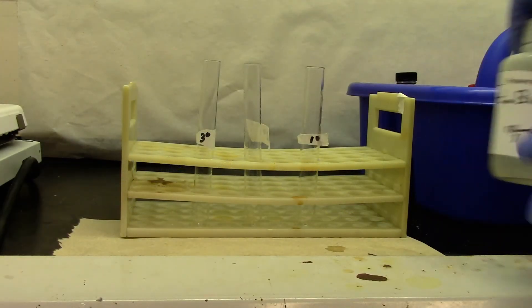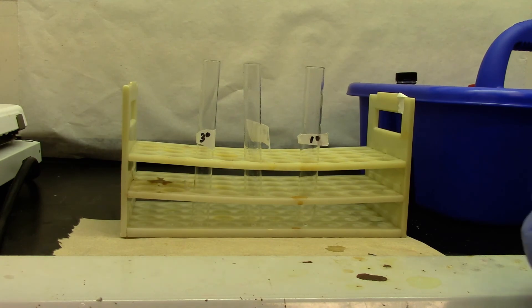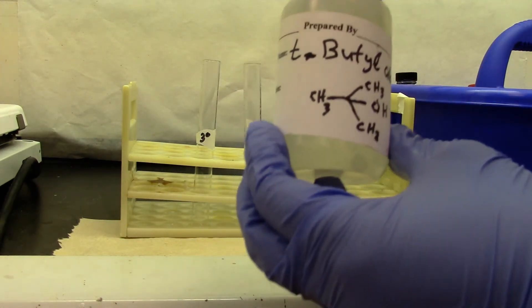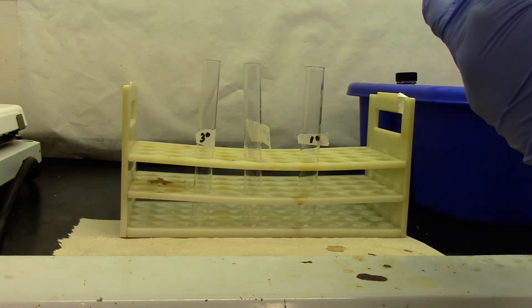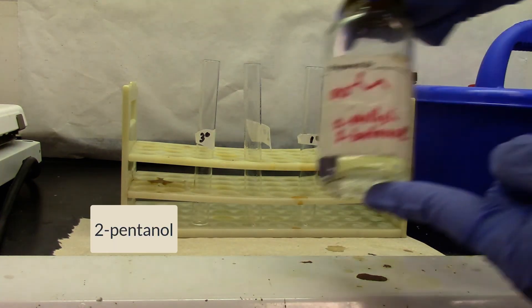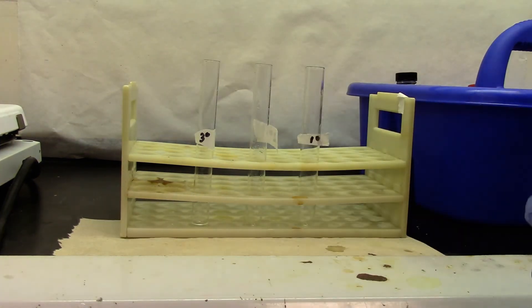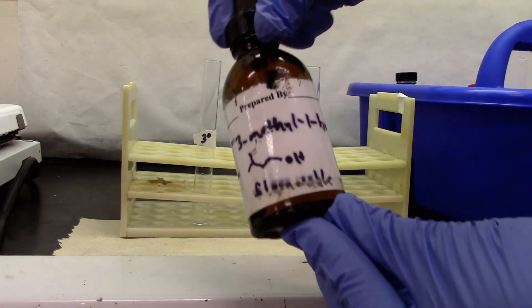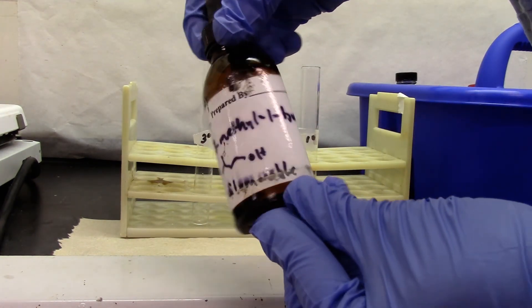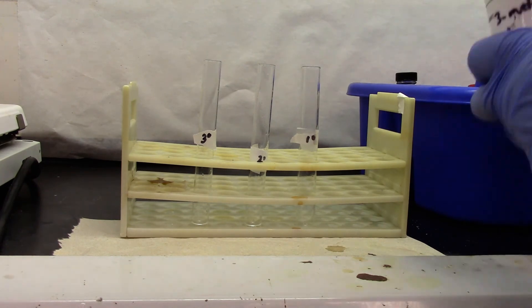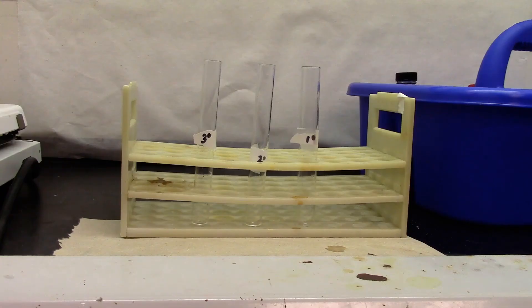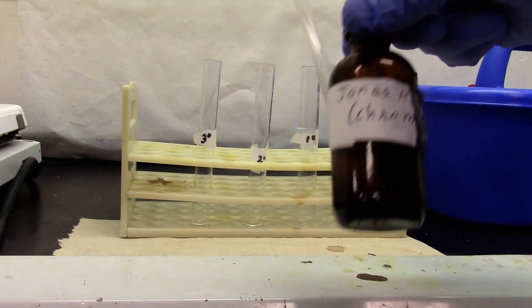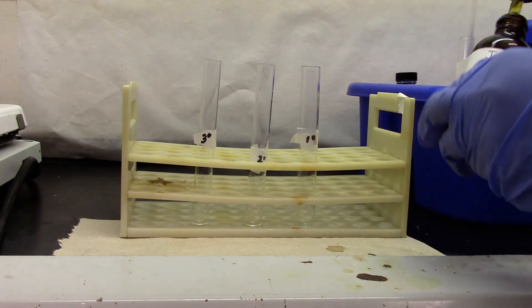We are doing Jones test for 3 different alcohols. That's my tertiary butyl alcohol, that is my secondary alcohol, and this is my primary alcohol, 3-methyl-1-butanol. I am going to add Jones reagent, 2 drops to each of these.